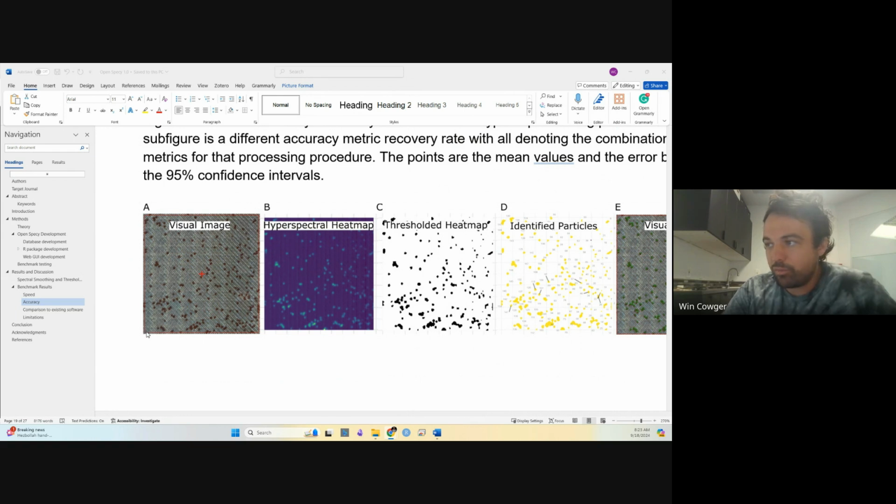So we might just be like a single line here, and we'll just go up and down and kind of snake and collect the measurements, and then they all get stitched together. There's also a QCL, which I don't know a ton about, the quantum cascade lasers. There's different ways that they can be configured. I know they're similar in some ways to a focal plane array, where they can kind of look at a larger region at once and collect an image. So there's a bunch of different techniques.